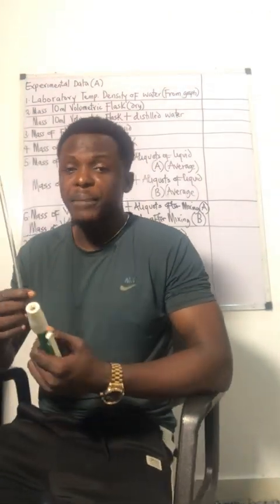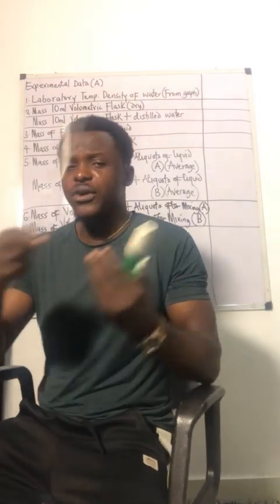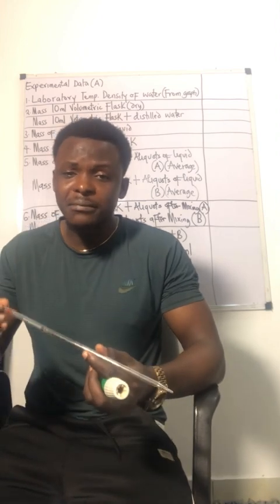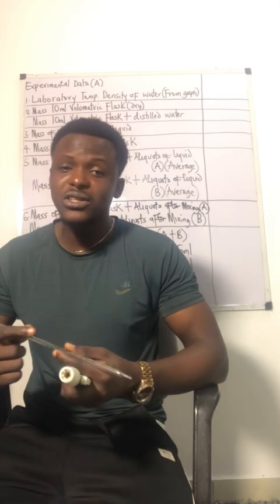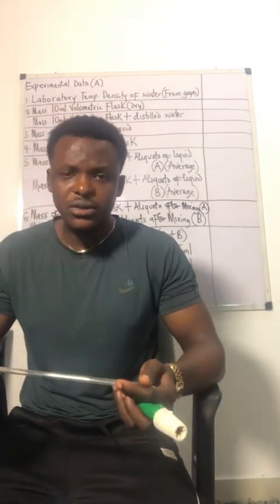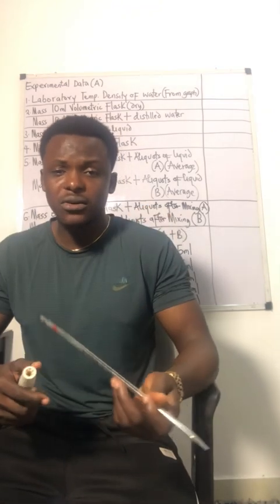I have here with me a pipette. Of course, we all know what pipettes are. A pipette is used to transfer liquids. But if you could recall back in secondary school, when you were conducting your practicals, titration precisely, you realize that most of the time students suck the pipette with their mouth. That is actually not the best procedure. What if in the process of trying to suck up the liquid, it passes down your throat? You might be exposed to certain burns because of the toxicity or perhaps the corrosive nature of the liquid.